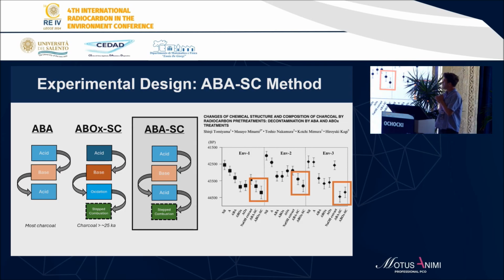So the fairly straightforward experiment I designed was to investigate particularly this step combustion step, which is quite similar to the ramped oxidation methods that were mentioned earlier today.